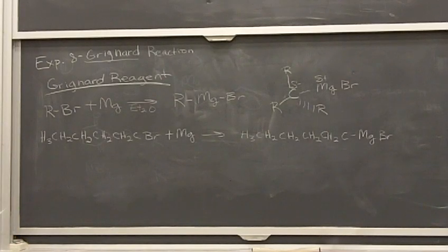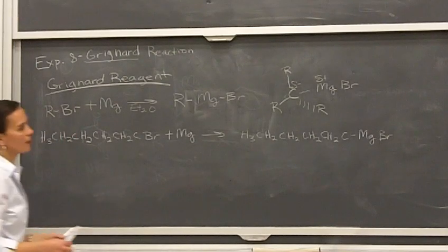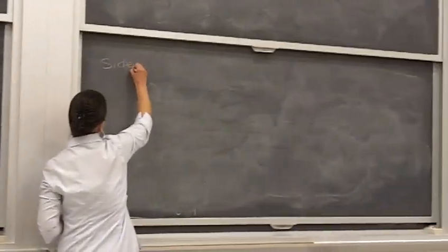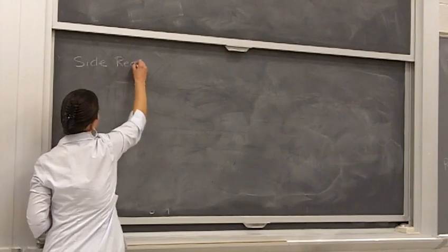Now in preparing our Grignard reagent, there's a couple things we need to keep in mind. There's some side reactions that we need to prevent from happening.